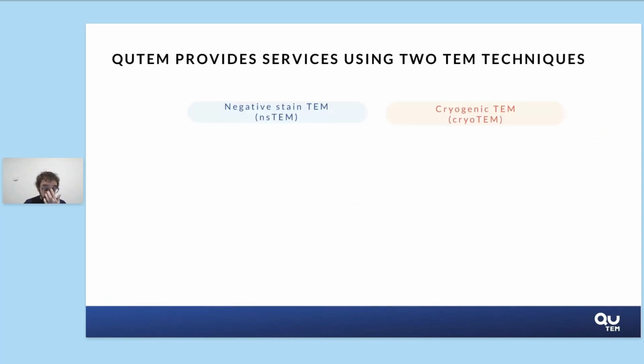So, some key differences and key similarities between the two methodologies. The first one is about the scale of specimen that we can work with. Typically in electron microscopy, you work with specimens that go from the nanometer range up to the micrometer.